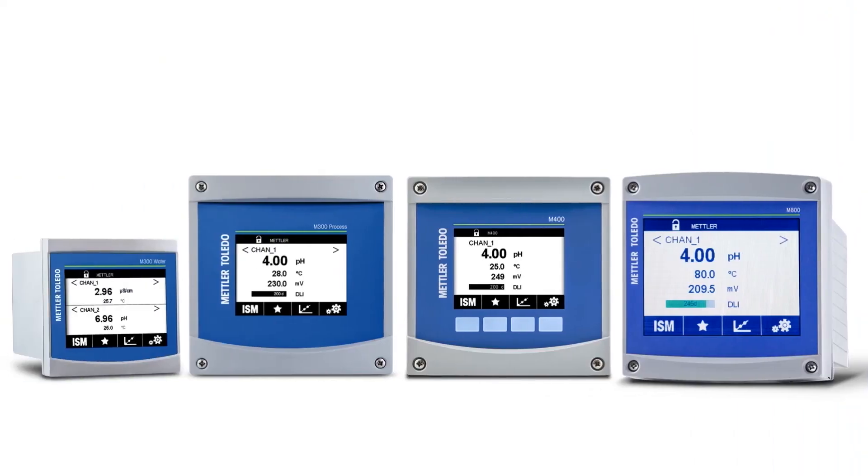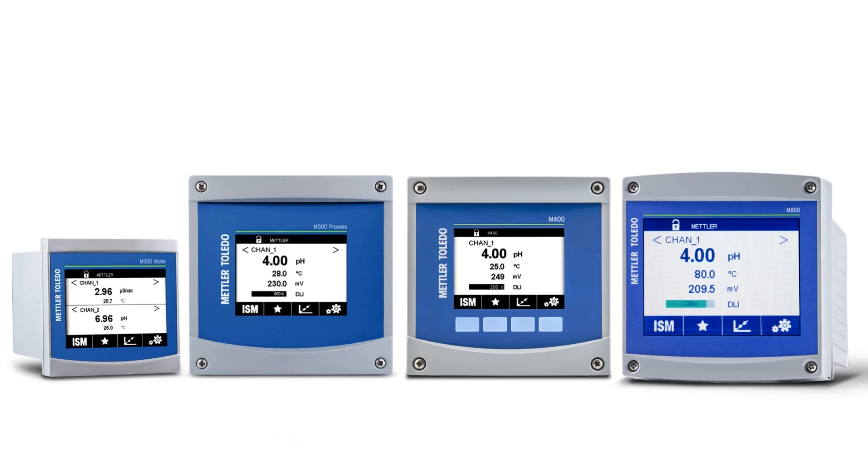The Transmitter Configuration Tool from Mettler Toledo is available for the M300, M400, and M800 transmitter series. The TCT can be downloaded for free on MT.com.